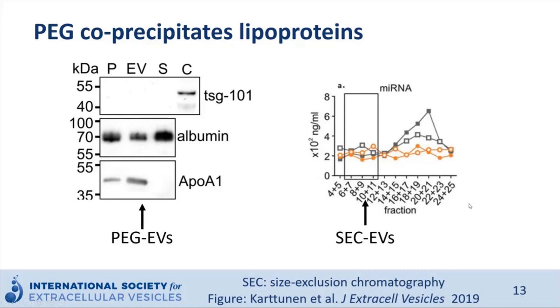And the later fractions enrich proteins. In this figure, we could see that microRNAs are equally abundant in the EV and protein fractions. This suggests that if we are focusing on EV microRNA detection for some diseases, protein contamination will bring non-EV microRNAs into the research conclusions.